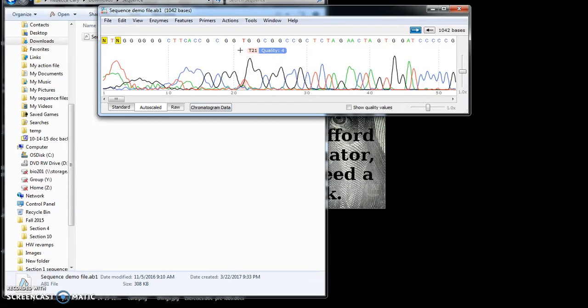So here's our sequence. It's color-coded from our Sanger cycle sequencing process. See here at the far left how the peaks are jumbled together and on top of each other, but there are still letters from the computer's attempt to identify the bases.